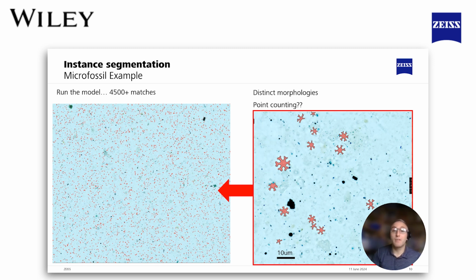So when you're tackling the same types of sample again, or looking for the same things, you can just say, right, I want to run these microfossil types through a set of new images and see if it picks up things that I've found before, or keep adding to those libraries just so your models are better trained and have got more information in terms of the variation of the types of feature that you're looking for.